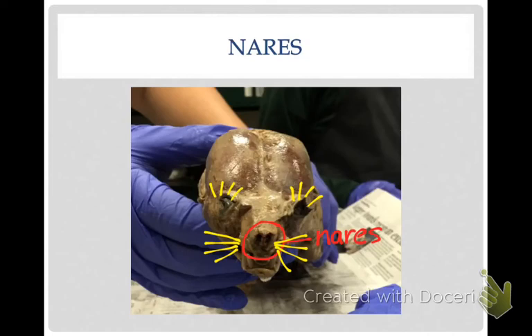Again, you wouldn't see these whiskers because when the mink is skinned, the whiskers are taken off with the skin. You also could see some whiskers in the chin area as well. So they're all used for tactile sensation, and again, they have sensory structures in them that send information back to the brain. So those are all the external organs that you need to be aware of.